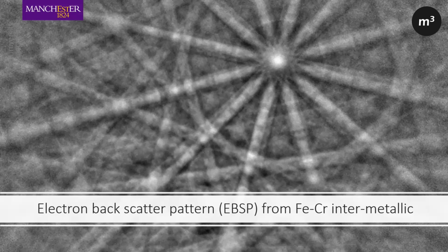But one aspect to think about is that these bands are actually physical extensions from the sample. So if you were an electron sitting on the specimen, hit the specimen, and then went to the detector, you would actually follow these lines. So these lines are formed in real space, so to speak.